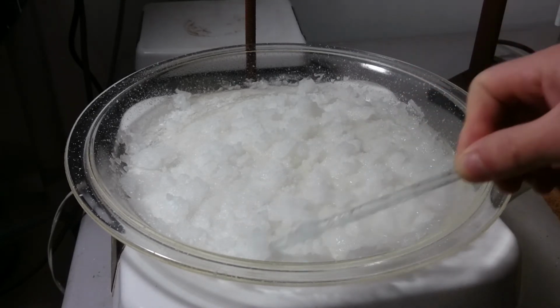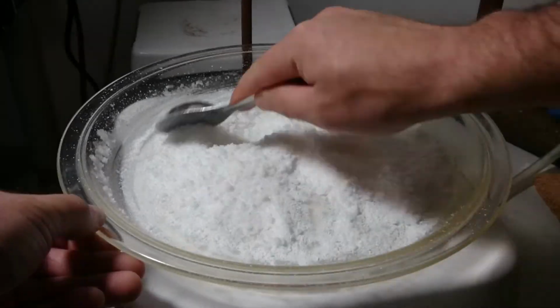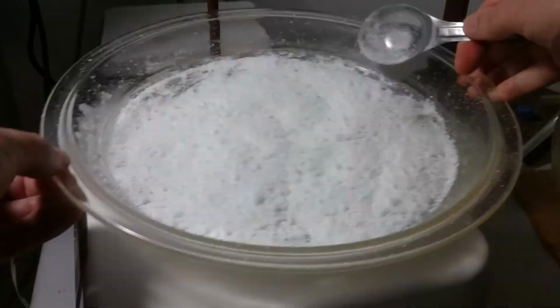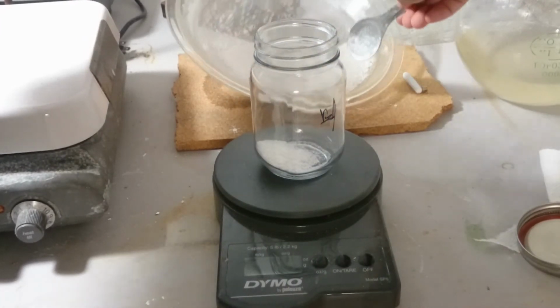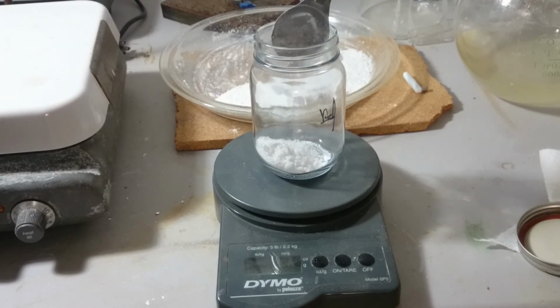Because this is a hydrate salt, it will first melt before the water boils off, and we're left with a dry, white, opaque powder. The product is then weighed and stored for future use. My yield was slightly over the theoretical 192 grams. I think this is due to impurities in my sodium carbonate and the small amount of residual water that may remain.